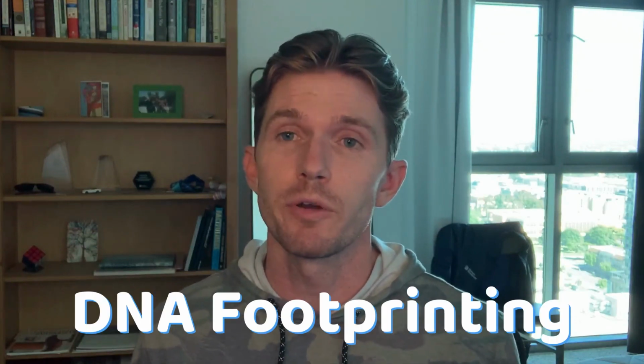The last technique I want to share with you is DNA footprinting. For this technique, you get an agent, DNase, or you can also use dimethyl sulfate to cleave DNA. And this method is used to identify the sequence that a protein is bound to. So what you do is you have the protein-bound DNA and you incubate it with DNase or DMS, and you want to get about one cleavage per strand of DNA. And that protein will actually protect the DNA that it is bound to, so you won't get any cleavage in that region.